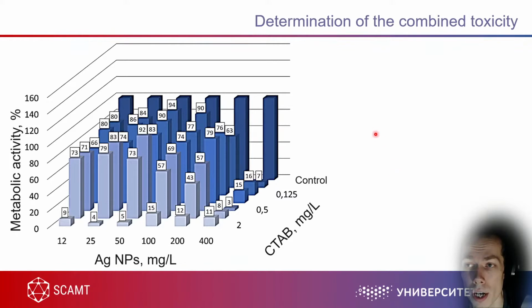So using just a metabolic activity test like the MTT assay, you will obtain these results, and these results will look very strange to you. But to understand what has really happened to your cells, you will always need some direct ways.